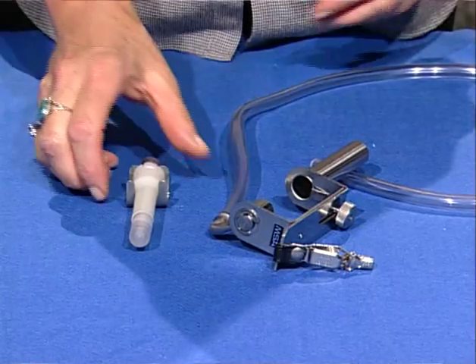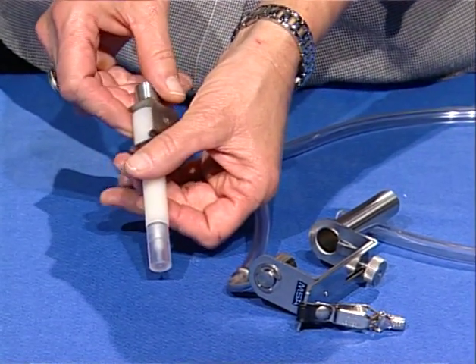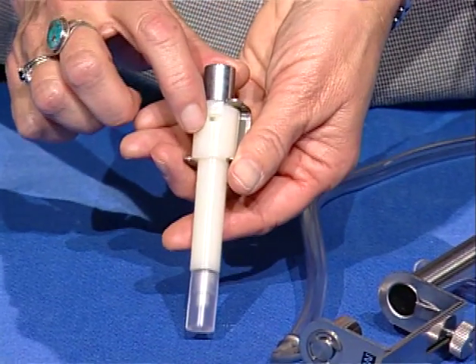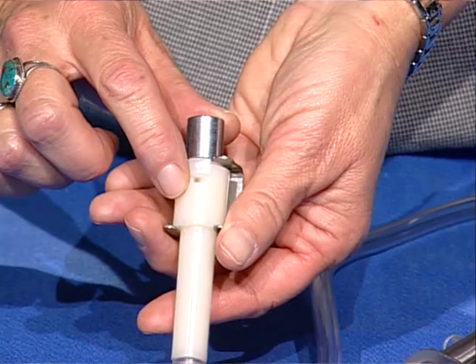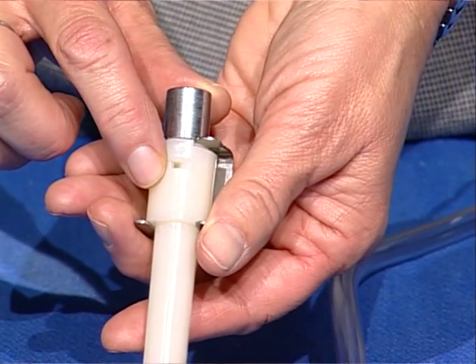Sampling cyclones are precision-made devices manufactured to very tight specifications. They should be handled with care and kept clean. It is important not to damage the inlet, as this could affect the size distribution of the material deposited on the filter.